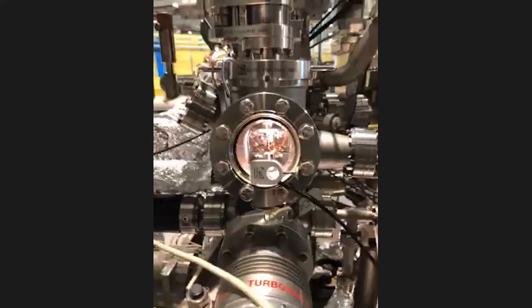I am near the ARPES Beamline, and I want to invite you for a little tour of our measuring system. So right now you should see our Beamline, and at the beginning, let's talk about this chamber.